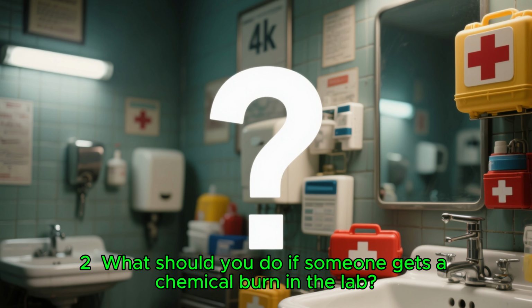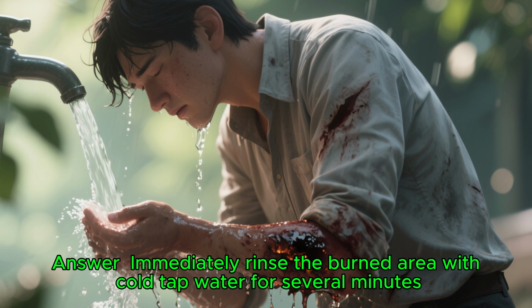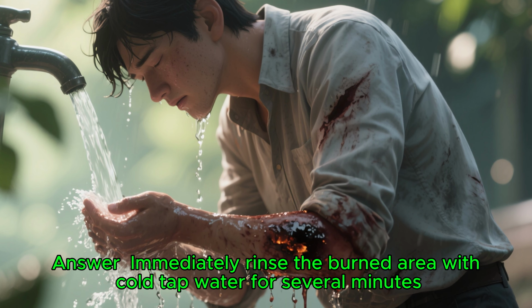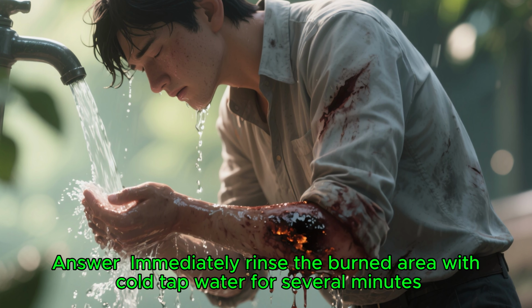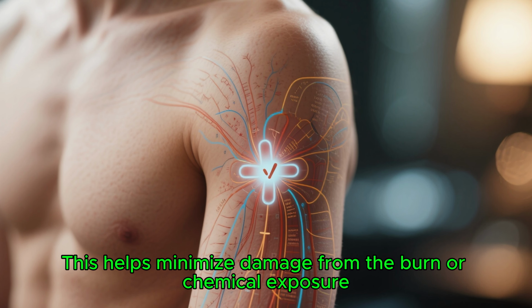2. What should you do if someone gets a chemical burn in the lab? Answer: Immediately rinse the burned area with cold tap water for several minutes. This helps minimize damage from the burn or chemical exposure.